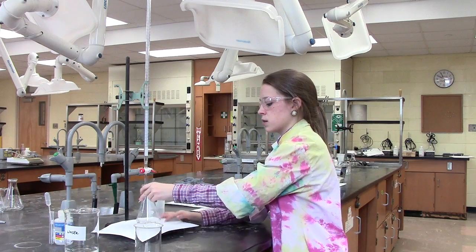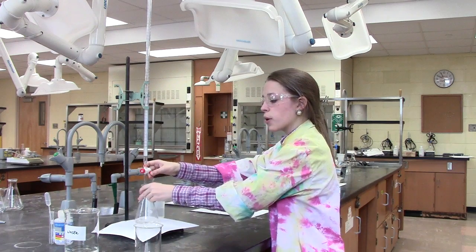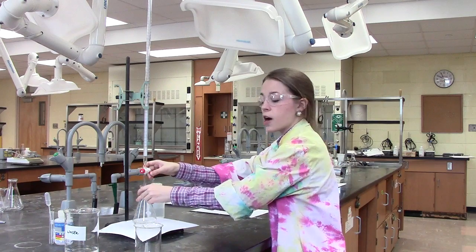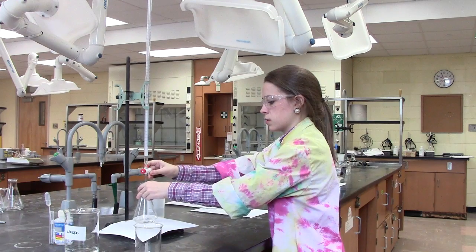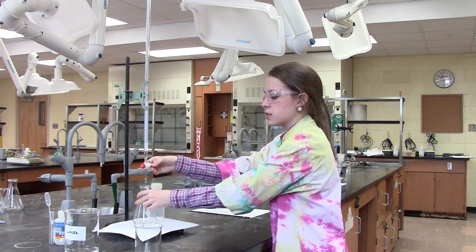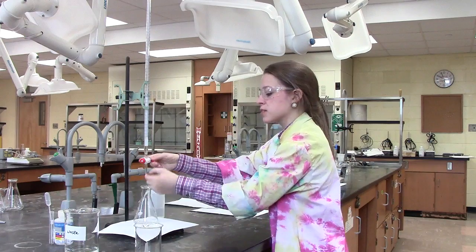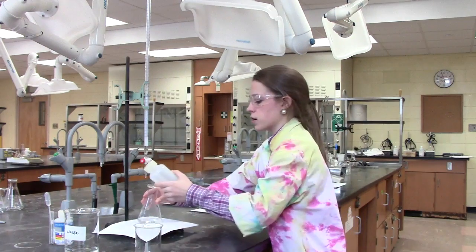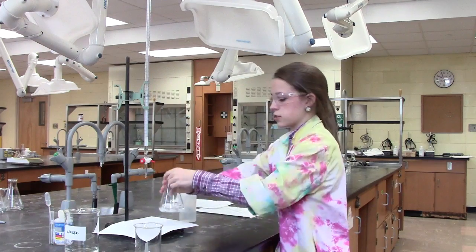I'm now seeing some pink, so I'm going to go more slowly. The endpoint is the point at which our pink solution persists for at least 30 seconds. Make sure when you are pouring your solution that you are using your dominant hand to stir the flask and your weak hand to operate the burette. Note that in the event that you get some acid or base on the side of your flask, it's perfectly okay to remove it using distilled water. This allows your two solutions to fully mix together.